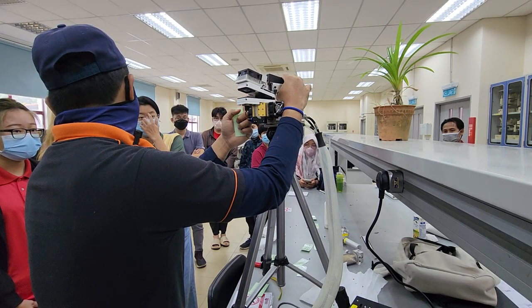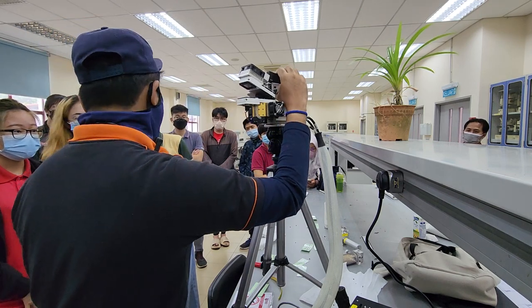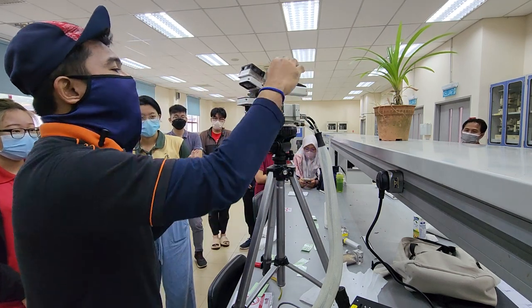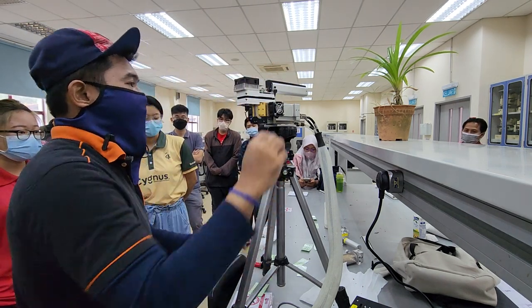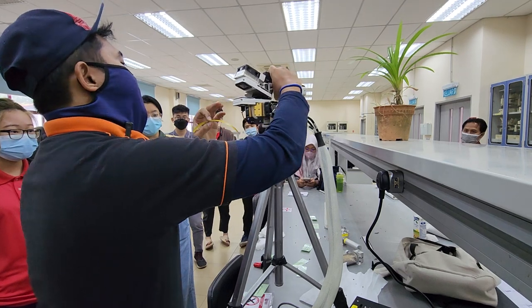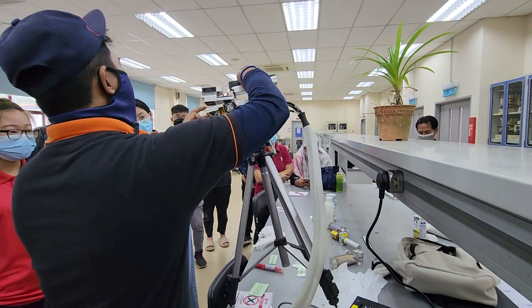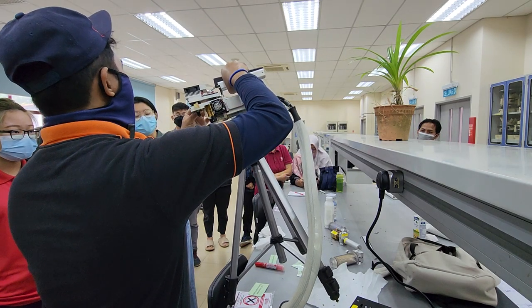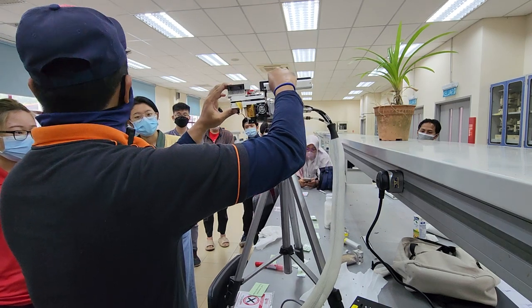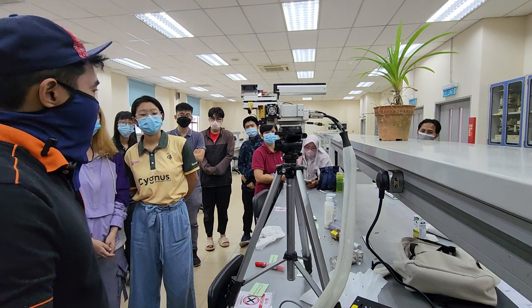Silicon light sensor, this guy on the inside here, gallium light sensor. All right, okay. So when you have clamped your leaf, make sure that your leaf can occupy the whole area inside here. If it cannot occupy the whole area, you need to know the area that you have clamped, because you need to tell the machine.